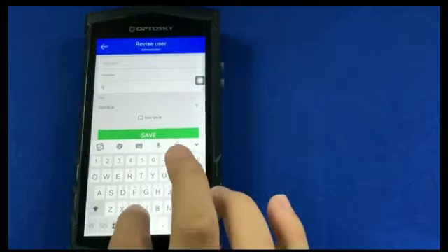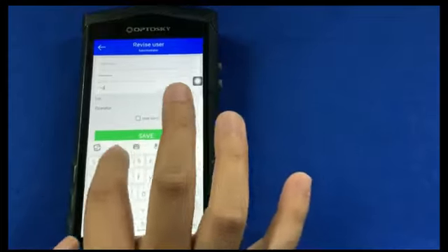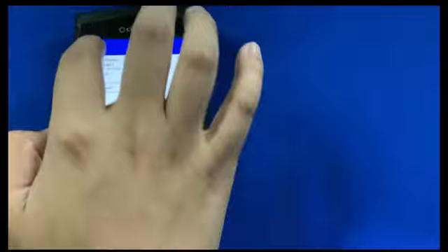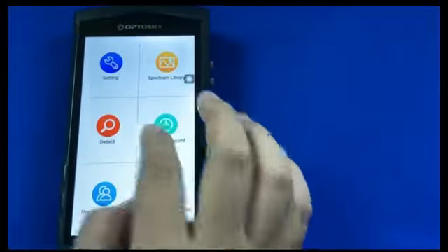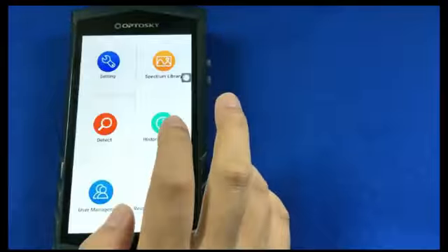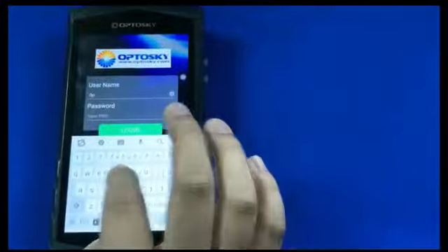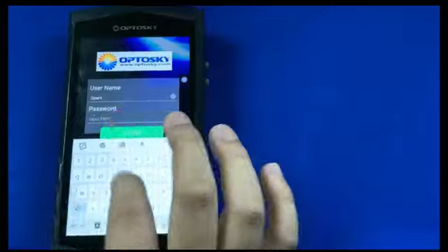So let's move to the test file. We perform the laser power test. First of all, log in as the supervisor and create a scan measure named laser power test.